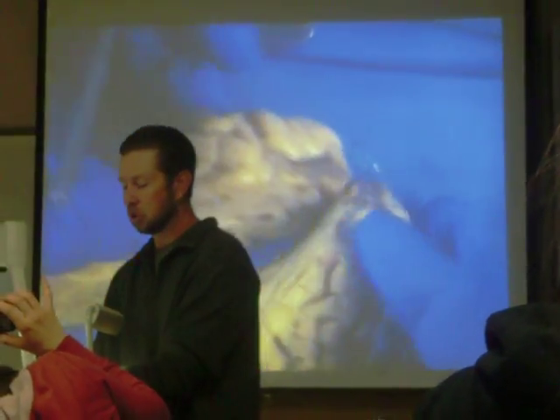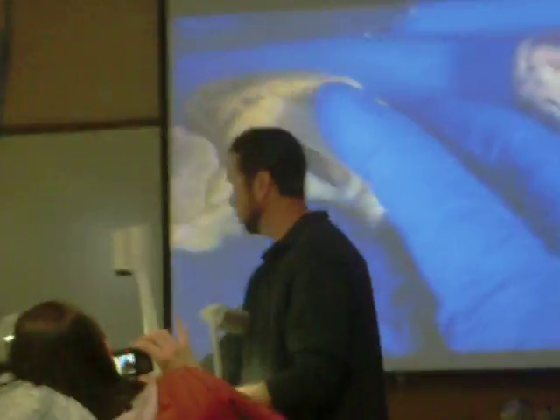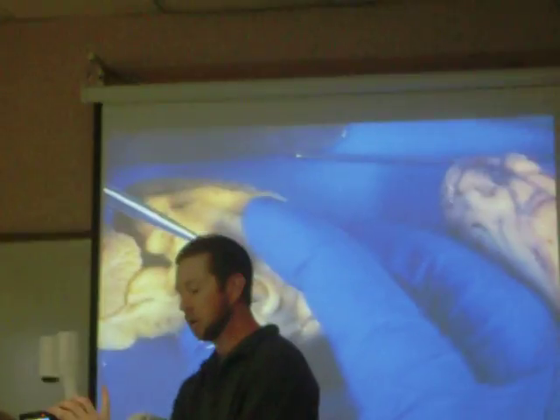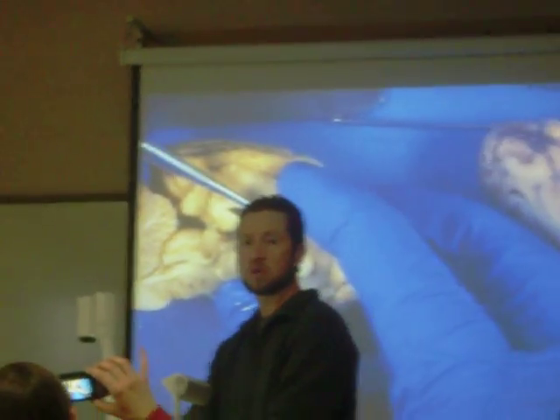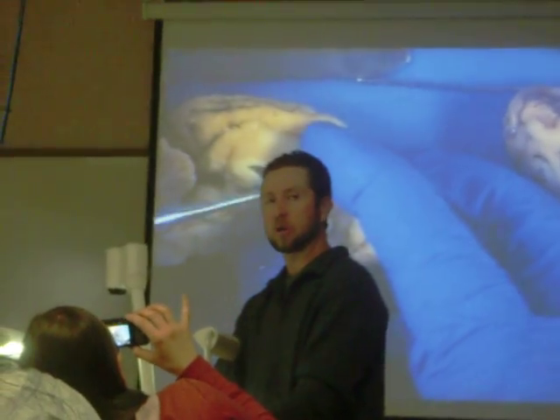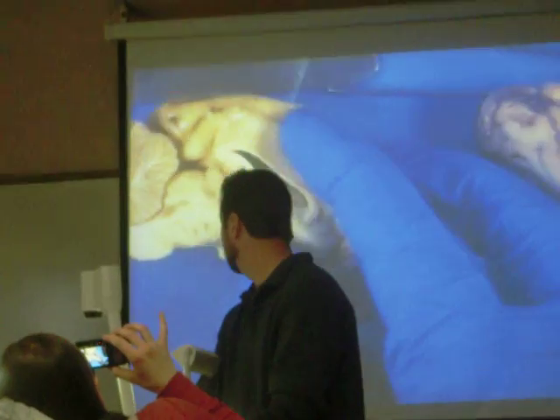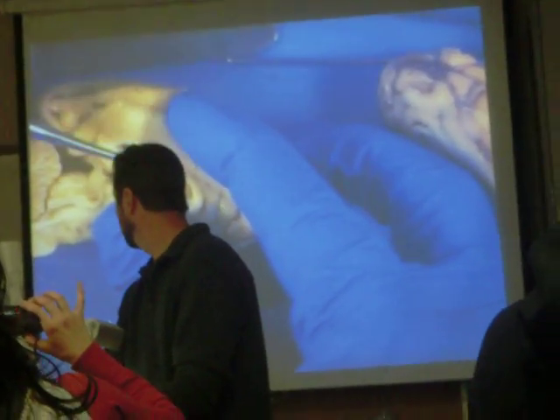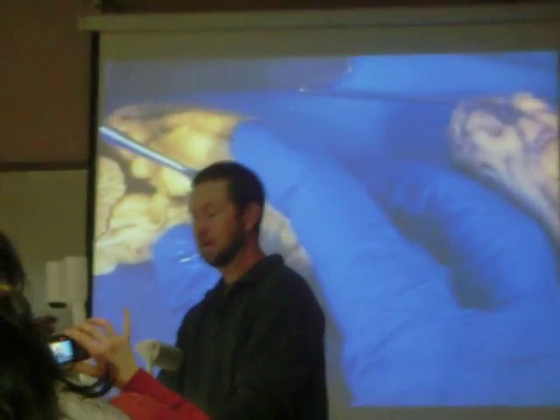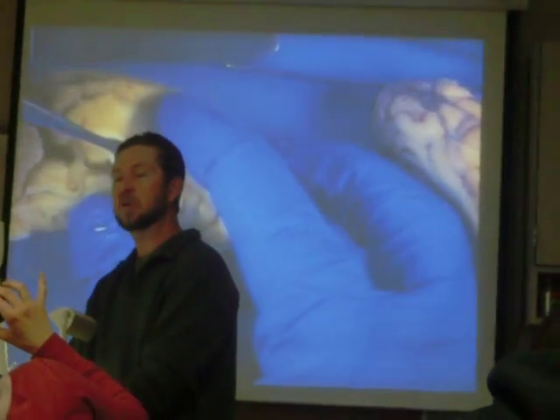What I'm going to do is show you the insula in a different view. If I open up and do a sagittal section, look inside here, there's a membrane film that covers this called the septum pellucidum. We'll come back to that. What's this space called? Anyone recall what this cavity is called? This is the lateral ventricle. So the cavity is the lateral ventricle.